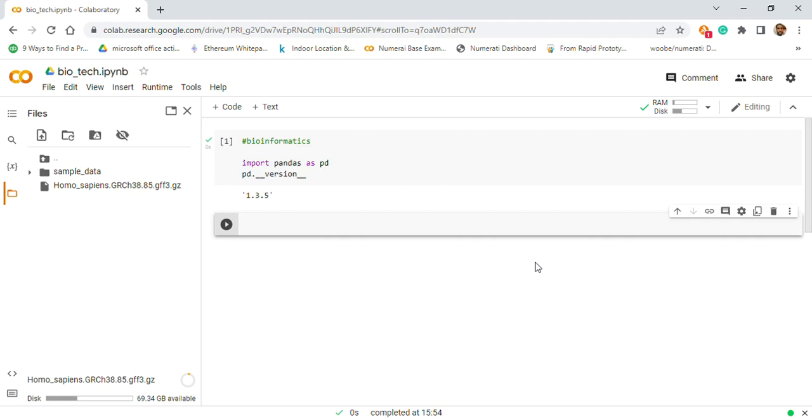It's really close. Like I said initially, this is more of an introduction to our genomes using Pandas and the SciPy stack for data analysis. Bioinformatics is actually an interdisciplinary field, a combination of data science and biology, that develops methods and software tools for analyzing and understanding biological data. So it's simply like data science for biology.